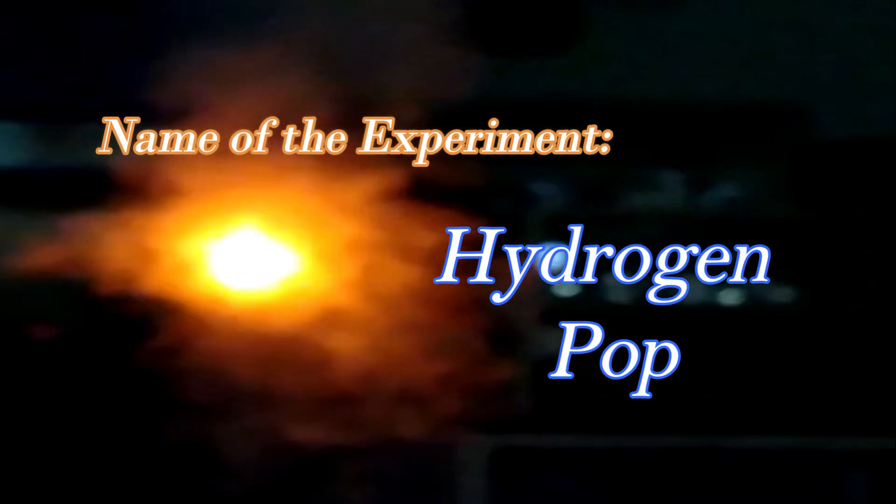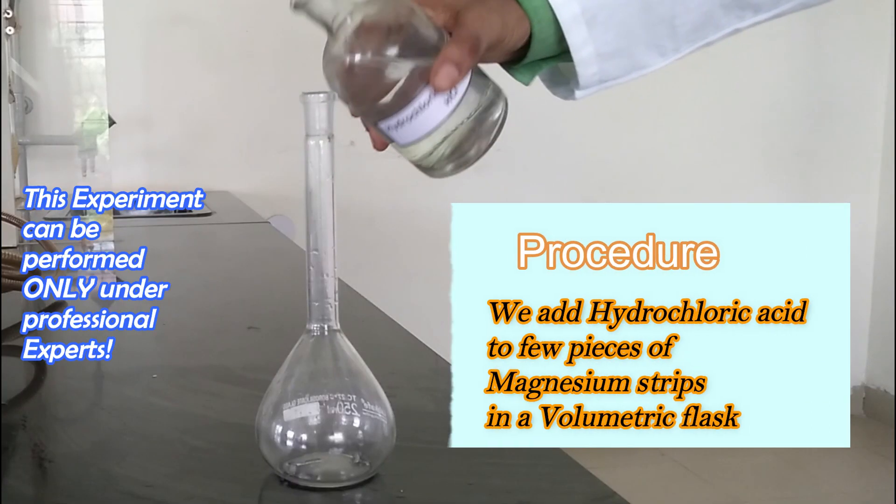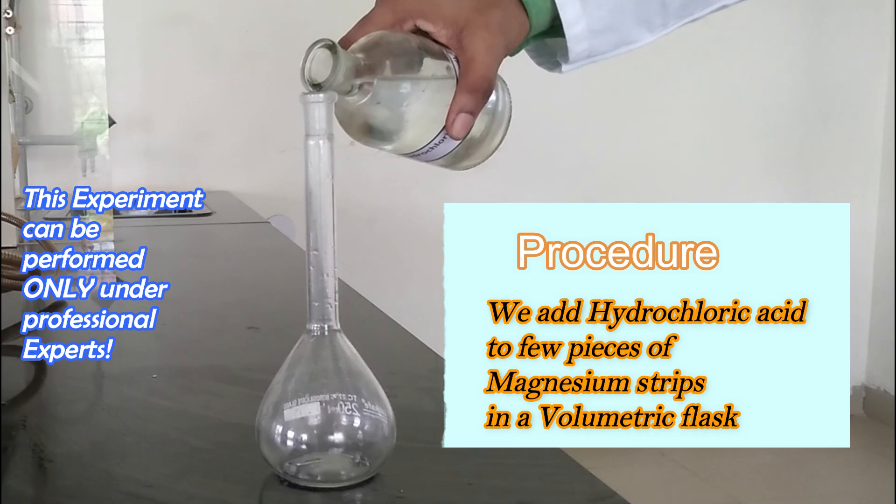The name of the experiment is hydrogen pop. The requirements are: chemicals — magnesium strips and dilute hydrochloric acid; apparatus — a flask; and materials — a matchbox. We are adding hydrochloric acid to a few pieces of magnesium strips in a volumetric flask.